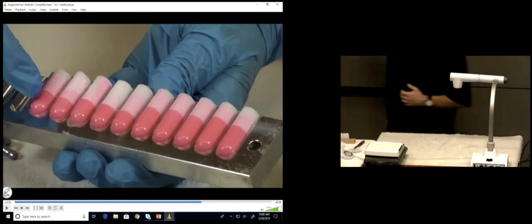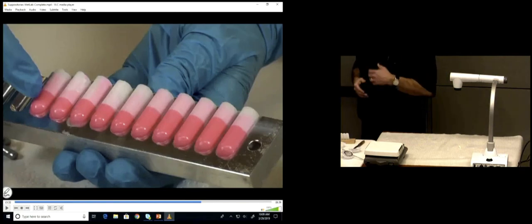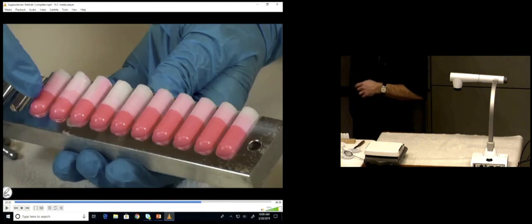Could you dispense those to the patient? No, they all have different amounts of drugs in there. So you do need to have 6 to dispense, right? So do you have to start all over again? Oh, hell no. What are you going to do with those? Can we reuse those? We can reuse those.